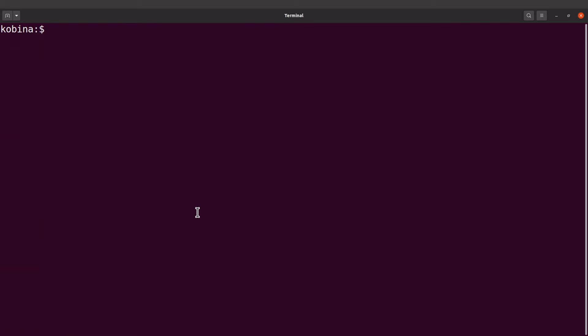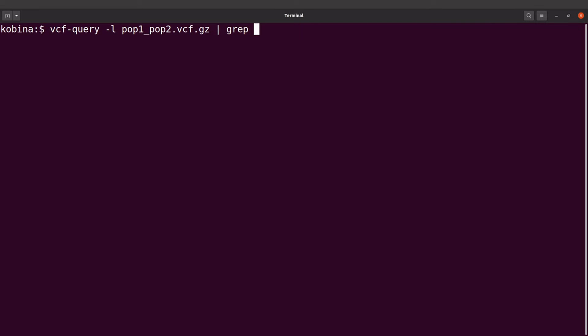So I'll say vcf-query dash l, I'll supply my file name, that's for the VCF file, and then I'll use a pipe and I'll say grep and I'll say PR like this.